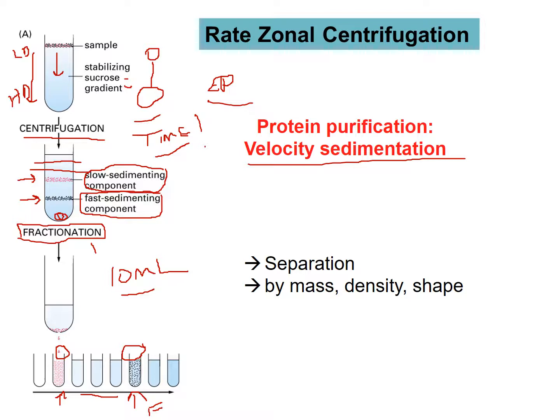We will see later that companies will actually sell you density beads in a little kit. These beads have different colors, and each bead has a certain density, so you can actually practice with a positive control with density beads, right? And you can see how that changes over time, and we'll see that. I've got a great slide. When you see that slide, kind of feed back to it when we're discussing the time issue and the empirical ways that we have to deal with rate zonal.